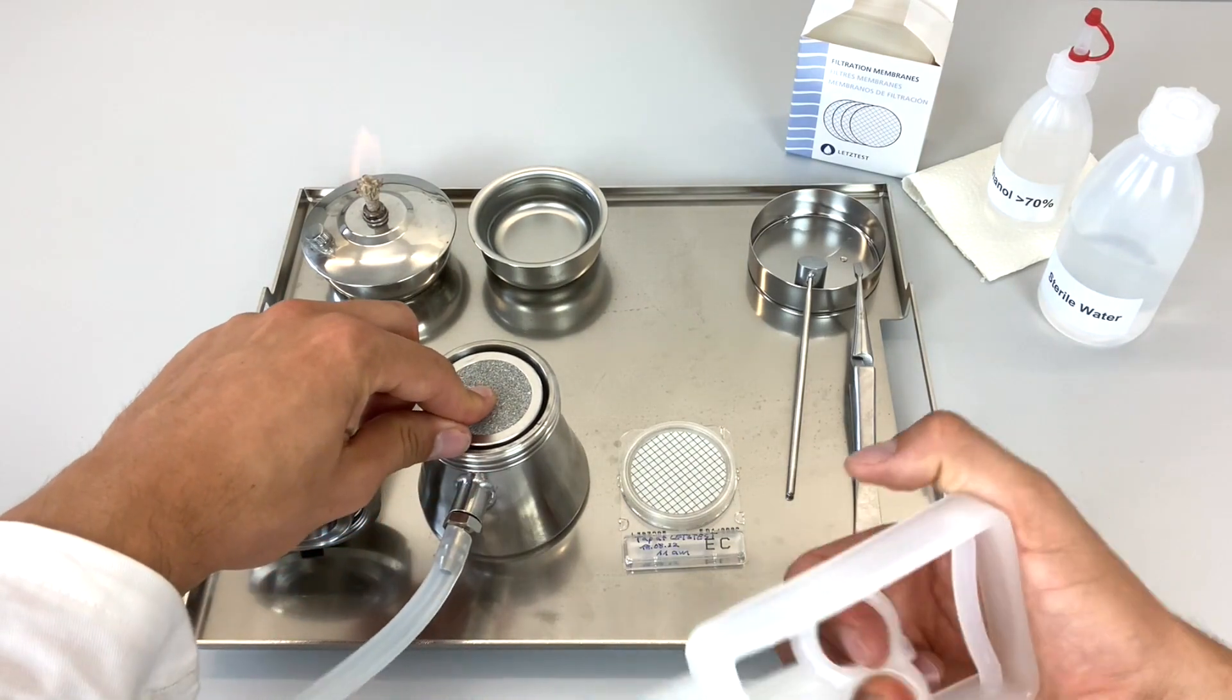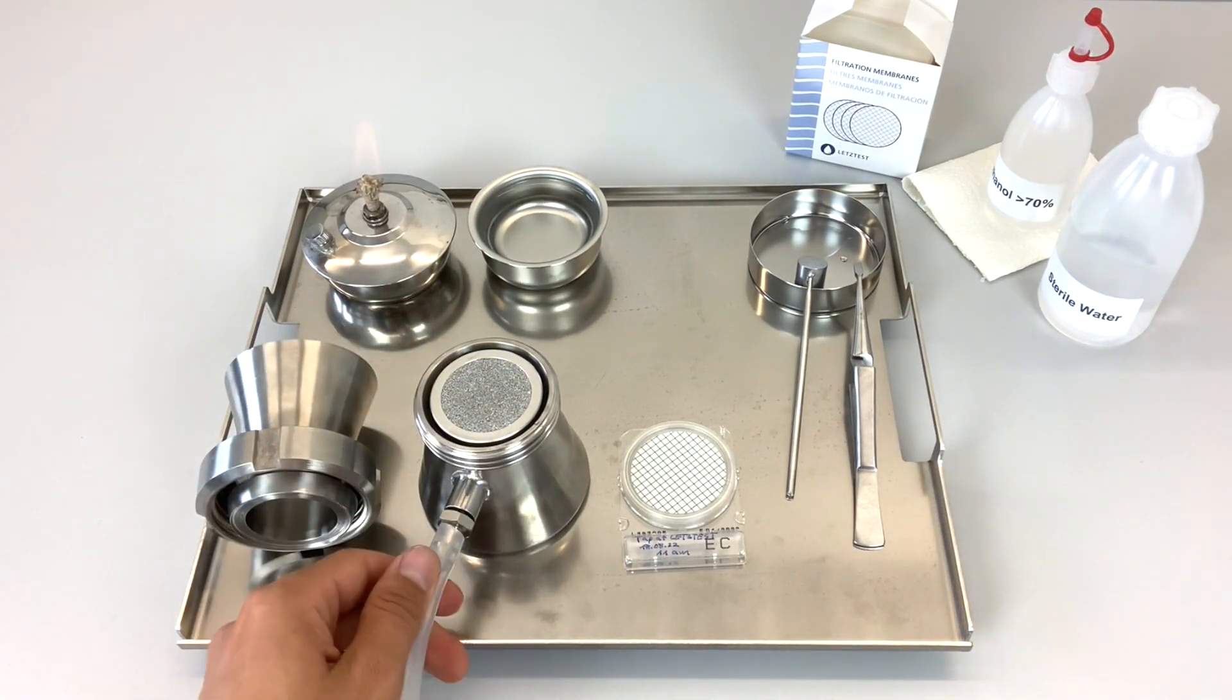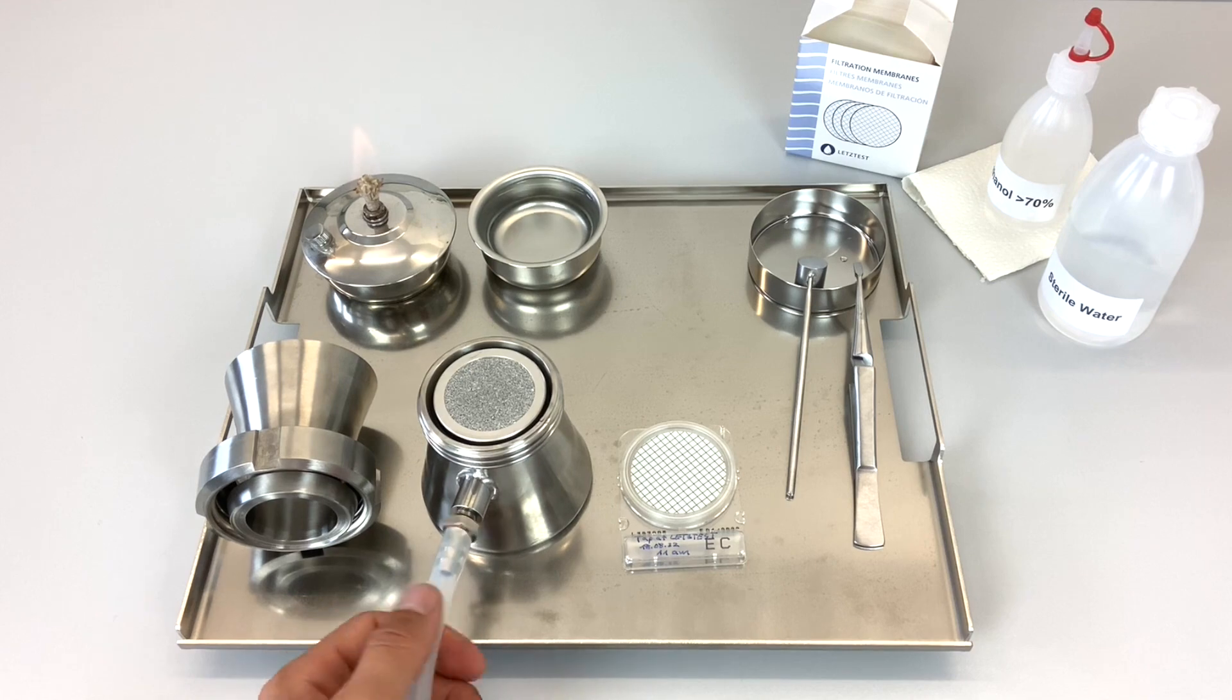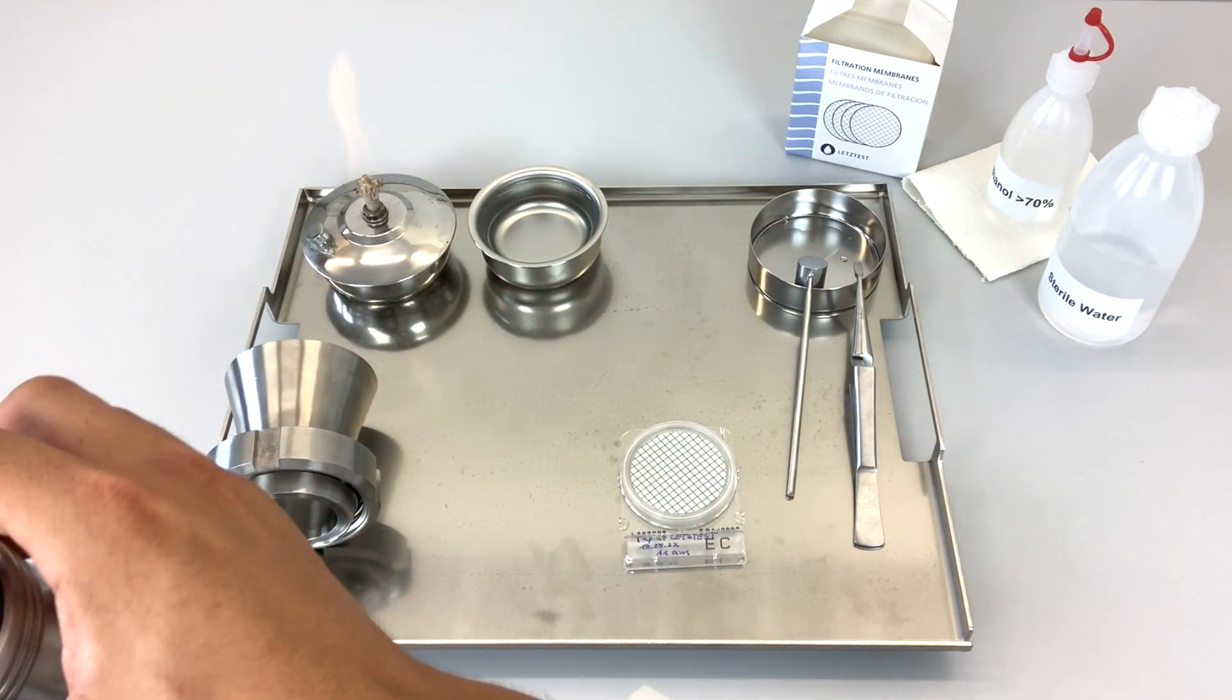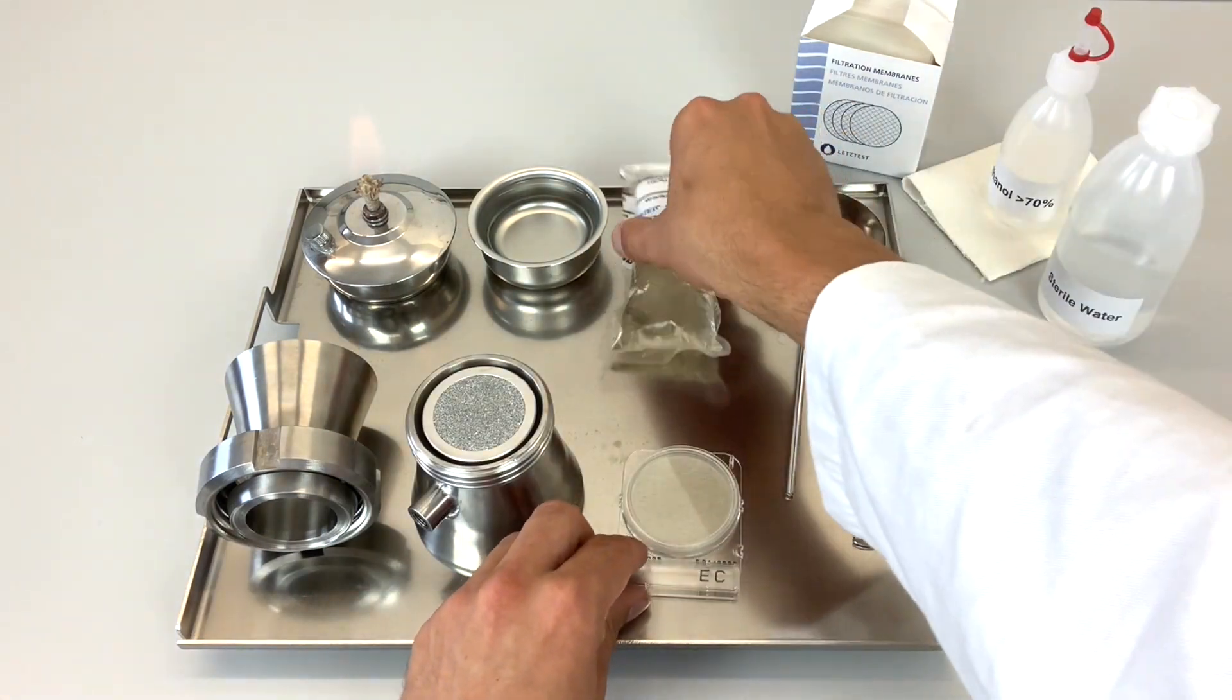As the last step, you suck out the excess water from the porous filter support. This will facilitate the next sterilization. You empty the base part and you continue with the next sample.